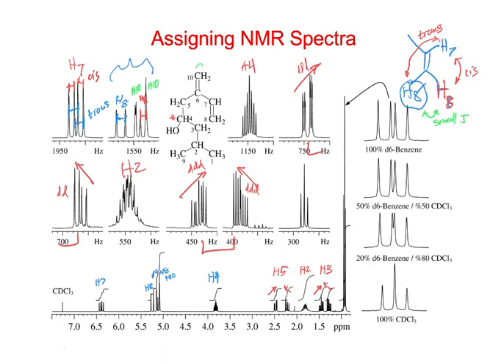All right. So we only have one last position here. This one down here looks just like a triplet, but there's nothing that really looks like it should be a triplet, right? And over here on the right side is an experiment they ran with some different solvents.